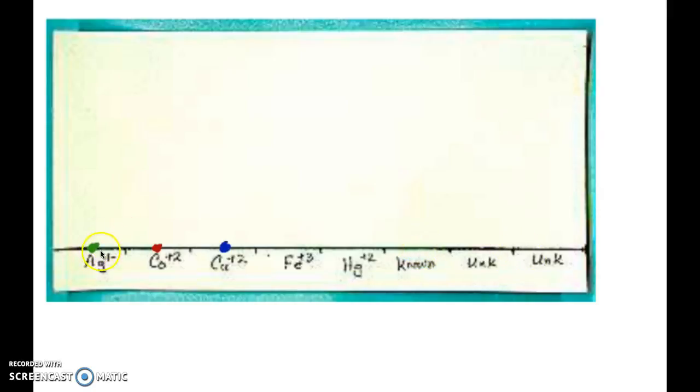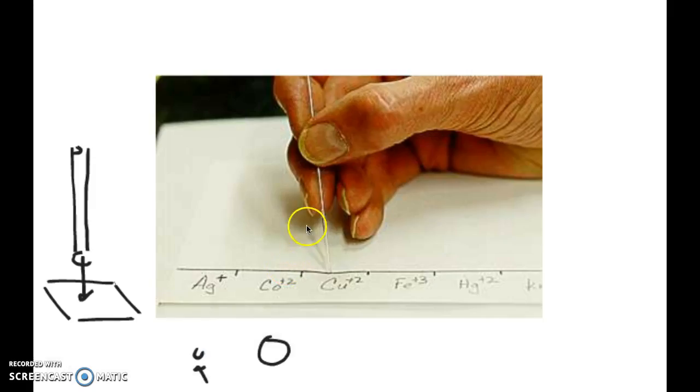The size of this spot shouldn't be too big or too small. You want it to be a certain size. I would make sure that it's big enough that you actually have sample. But you don't want it to be too big because once it gets too big, it might interfere, run into the other lane, and then it might contaminate the other sample.